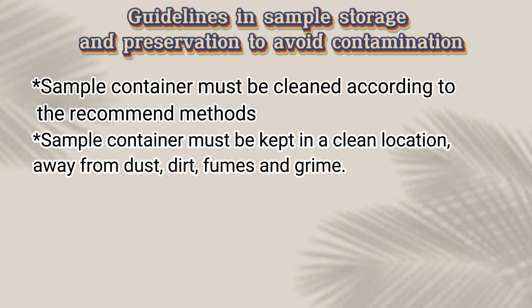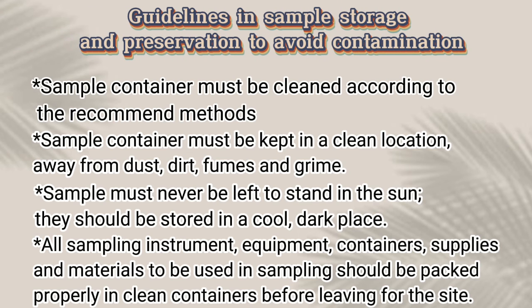Guidelines in Sample Storage and Preservation to Avoid Contamination: The sample container must be cleaned according to recommended methods. It must be kept in a clean location away from dust, dirt, fumes, and grime. Samples must never be left to stand in the sun; they should be stored in a cool, dark place. All sampling instruments, equipment, containers, supplies, and materials should be packed properly in clean containers before leaving for the site.